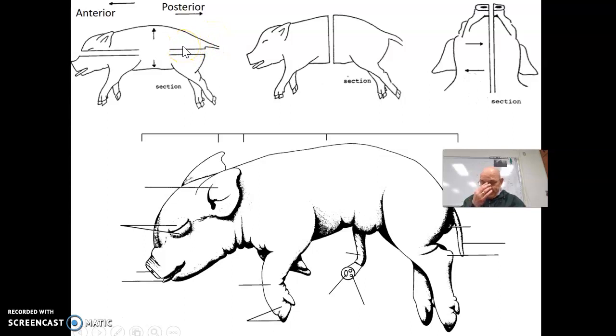All right, now for the pig, if it's toward the top of their back, that would be dorsal. Okay, dorsal is on our back also, but on the pig, that's also the superior, the top half of the body. Okay, whereas our posterior and our dorsal are the same, superior would be toward the top of the head.